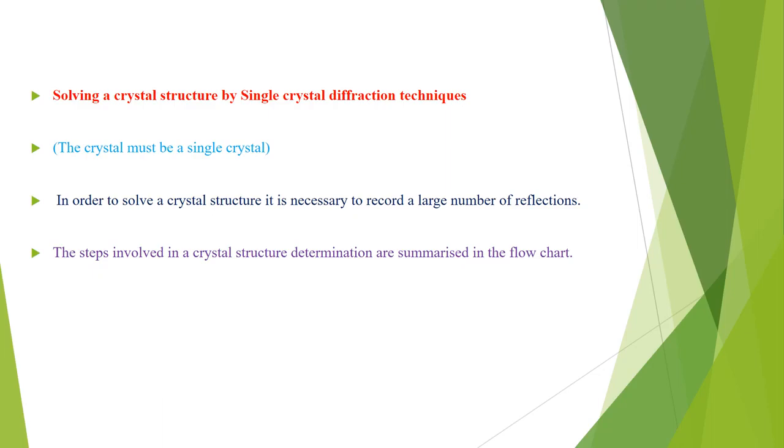And to solve the crystal structure, it is also necessary to record a large number of reflections that accurately measures their intensities and also their direction with respect to crystal orientation. Many experimental techniques have been devised to achieve this.